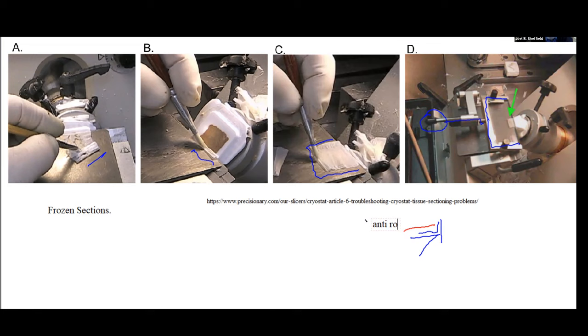The whole point of it is that it provides a kind of a static electricity barrier, or a charge, if you will, that keeps the section sort of unfolded and straight within that area. So what happens once you get a section, what do you do with it?